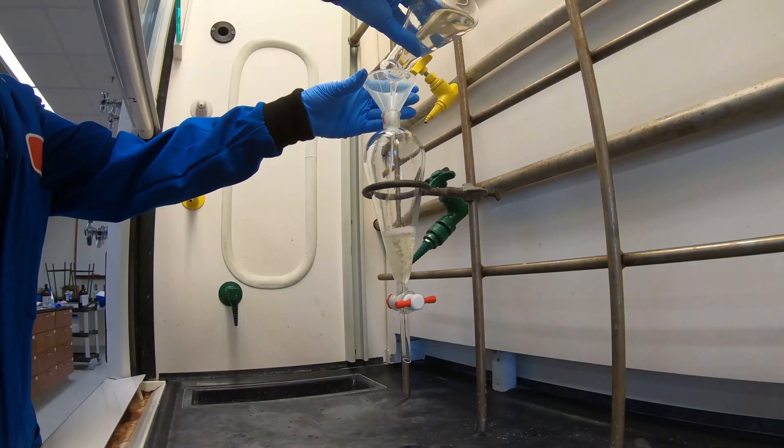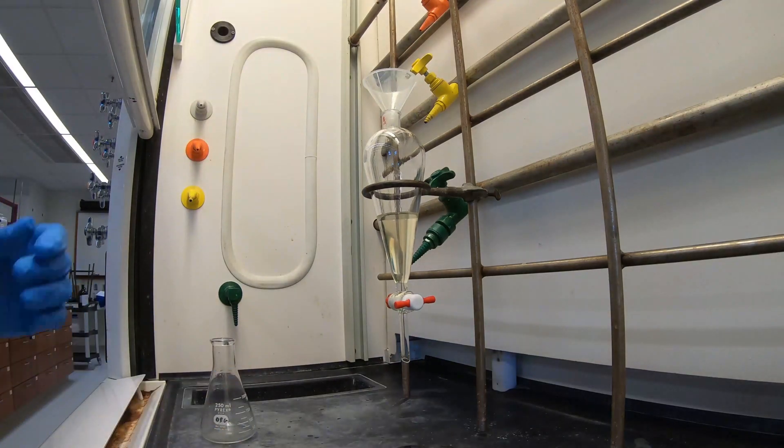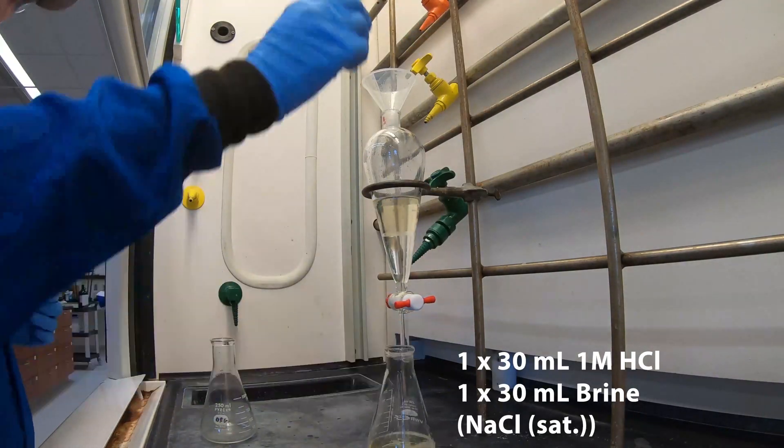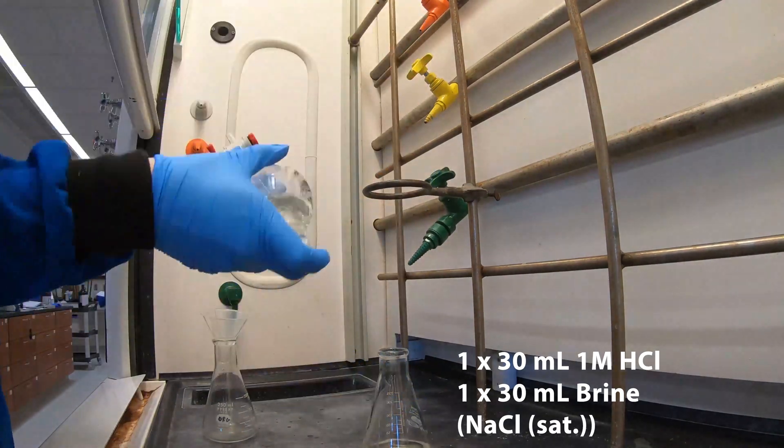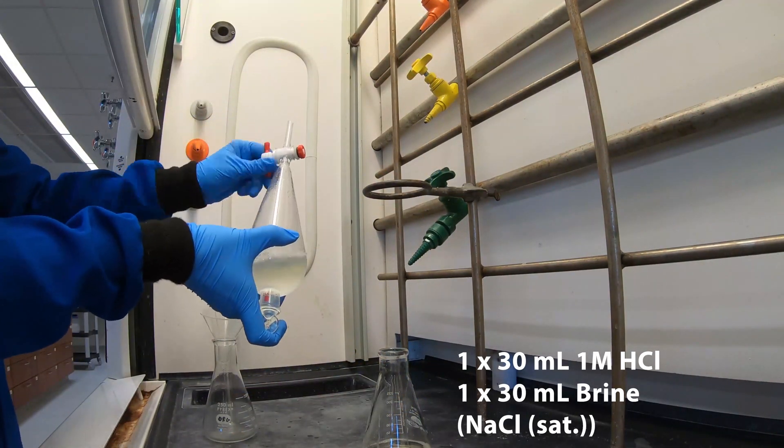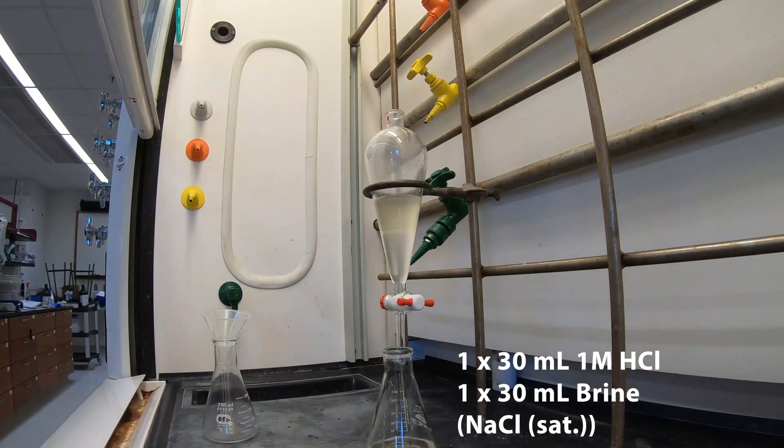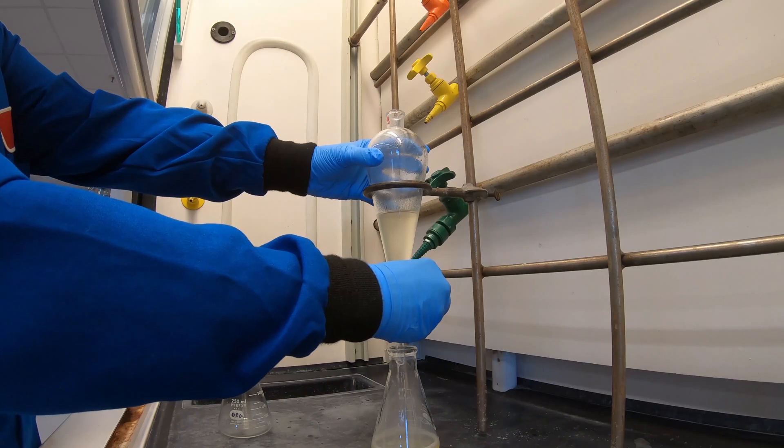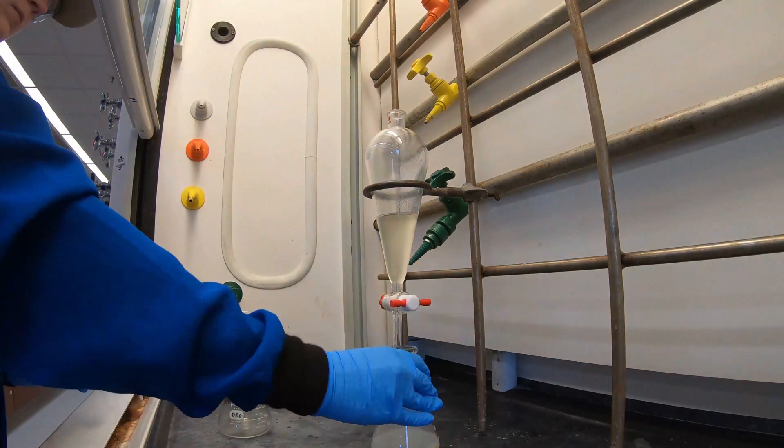Now we're going to transfer our combined ether washes to our separatory funnel. We're going to wash first with 30 ml of 1 molar hydrochloric acid. Collect the bottom layer in your aqueous flask. Then wash with 30 ml of saturated sodium chloride. Again, collect the aqueous bottom layer and then transfer your ether wash back to your Erlenmeyer flask.